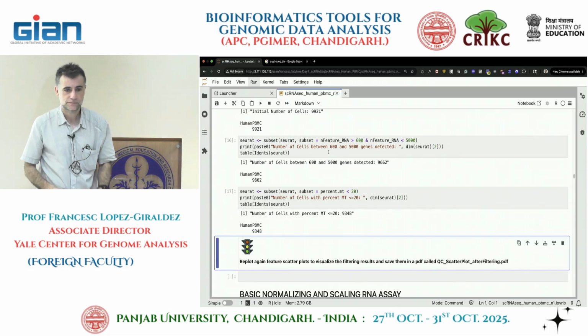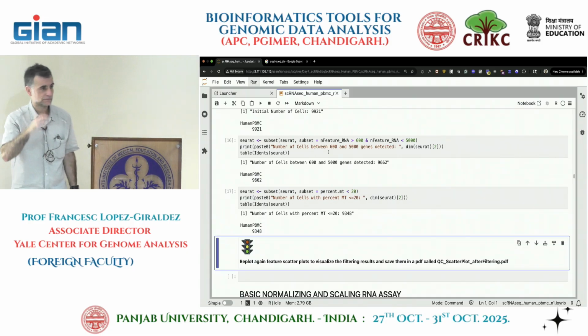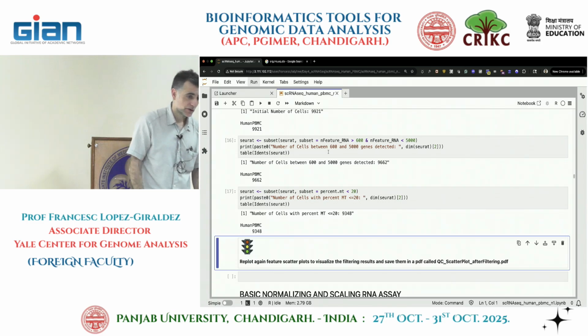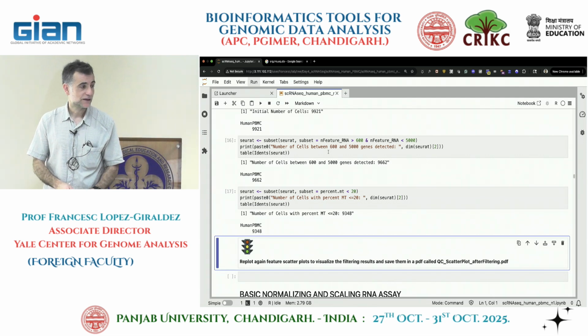If you look at this plot, mitochondrial percent only, most of the cells are expressing approximately 7% mitochondrial. So probably you shouldn't go below 7%, right? Maybe 10%. Yeah, go ahead, change that to 10 if you want to.